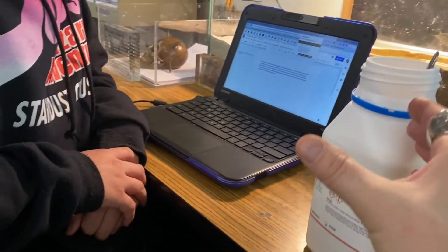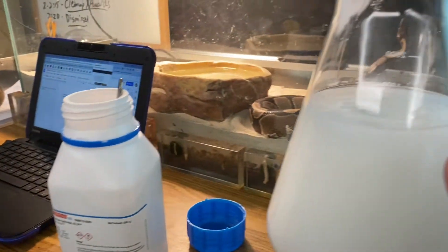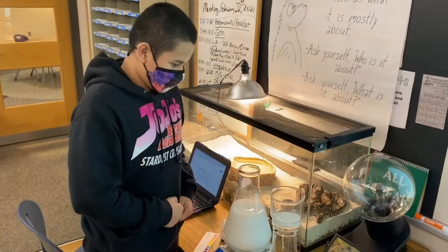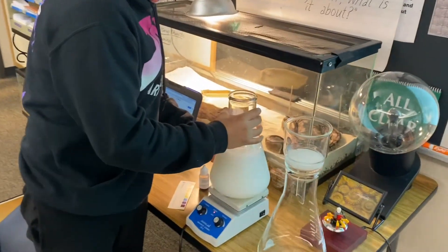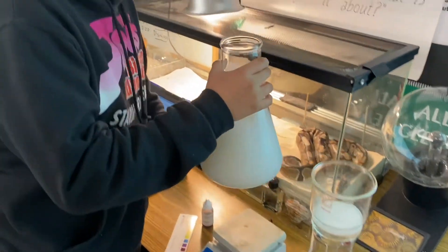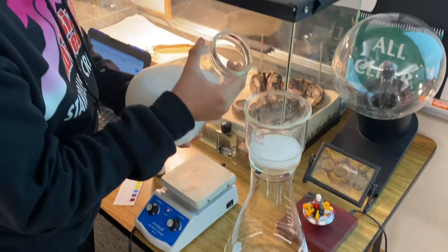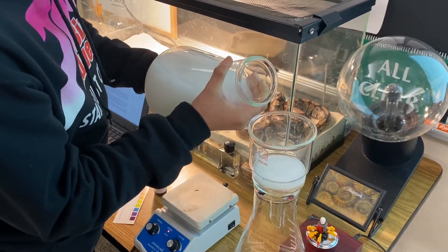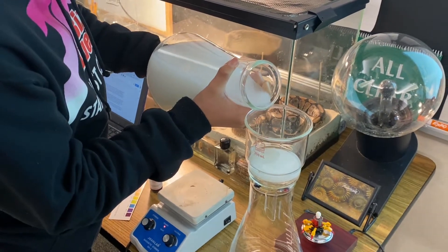Francisco is just mixing this calcium hydroxide until it turns into lime water. The next step is Francisco is going to take the calcium hydroxide solution and start to filter it. This takes some time, but you want it to be filtered into clear lime water.